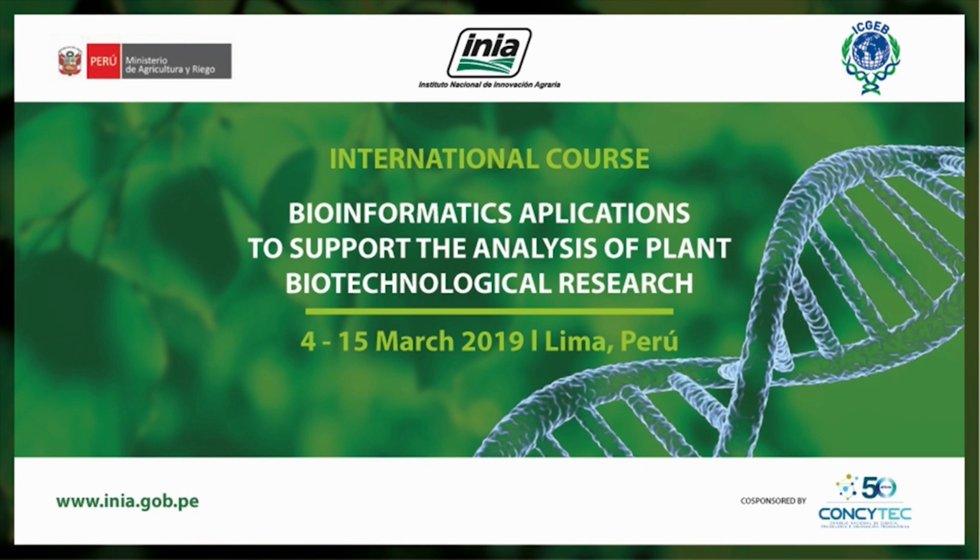You're going to do it yourself. I've created a small toy set from Arabidopsis that you copied to your INEA 08 directory. I should probably have erased it, but anyway.